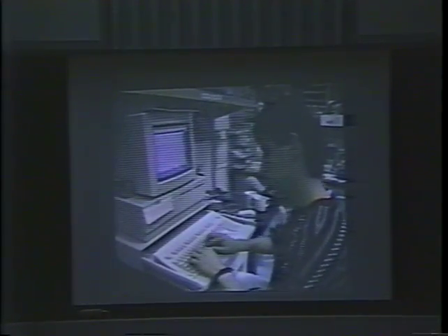Today, some researchers in Herzenberg's laboratory are focusing their attention on the AIDS virus. They are using the FACS machine to study the activity of single genes within individual cells. They want to know what activates the virus in helper T cells and how to monitor it there. Monty Montano, a graduate student in the lab, explains one research design. Essentially, we can quantitate the number of viral particles and their infectious activity using the FACS machine. Furthermore, because this system can be adapted for viable cell genetics, we can study the infection in viable living cells.